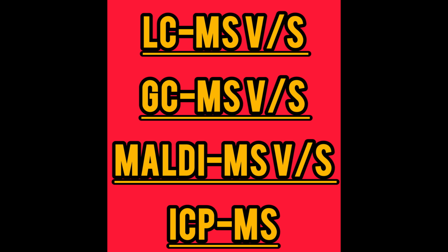Thirdly, you need to have practical considerations. GCMS is generally less expensive than LCMS and simpler to maintain. However, LCMS offers more versatility but requires careful attention to ionization, suppression, and method development. MALDI is excellent for high throughput screening but requires more sample preparation. And ICP-MS is specialized and typically focused in labs on elemental analysis.